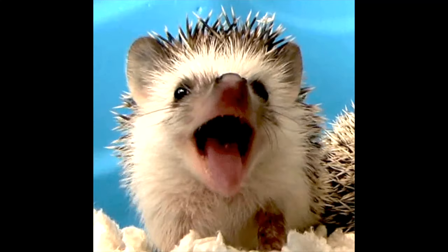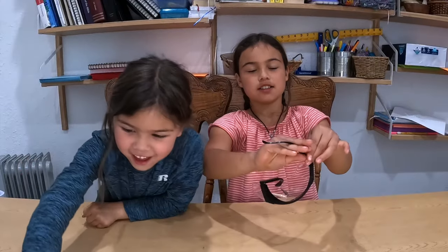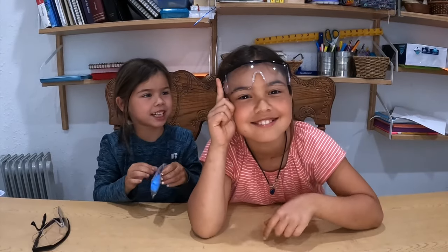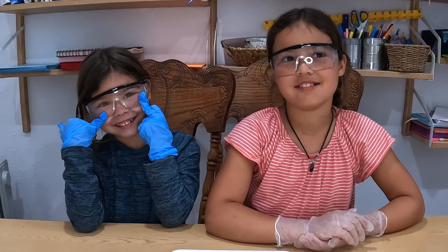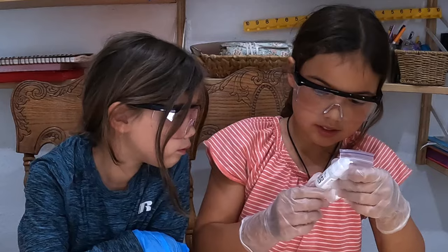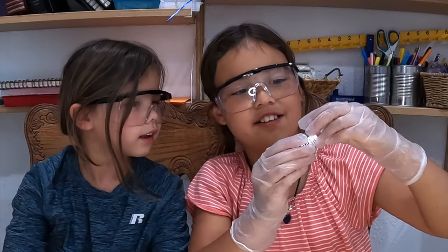Before we start, you know what to do — protect ourselves. These are some glasses to protect our eyes. Don't forget your mommy and daddy — always have an adult with you. We have tin chloride, sodium sulfite, and the zinc pellets that are going to turn into our tin hedgehog.